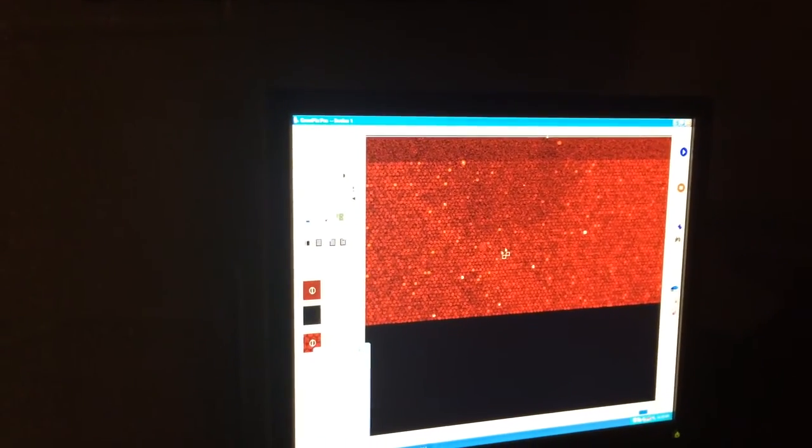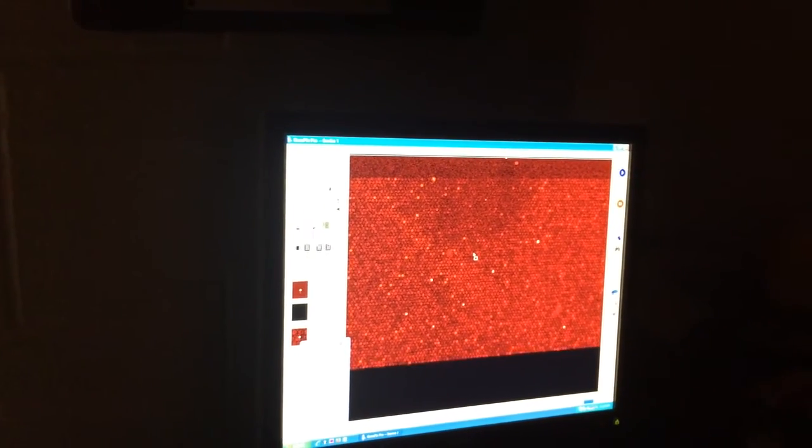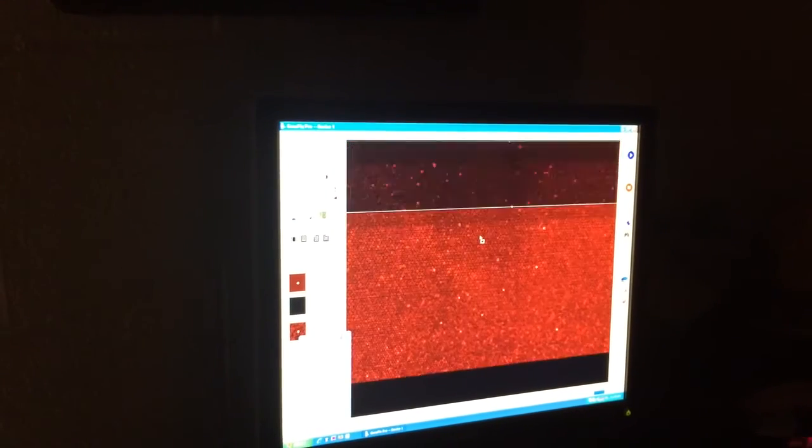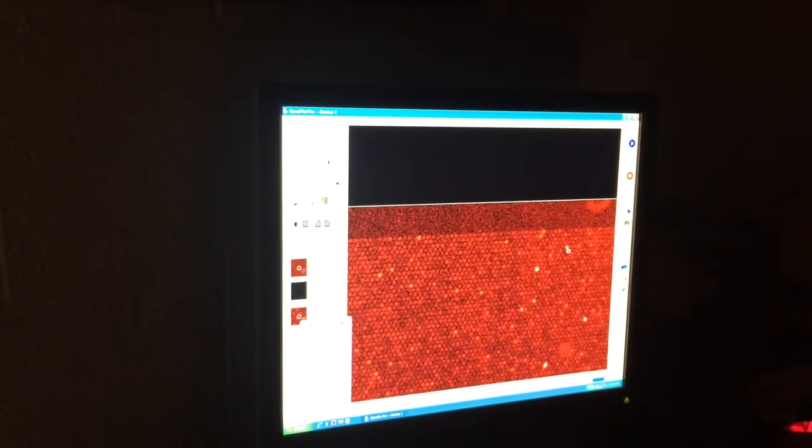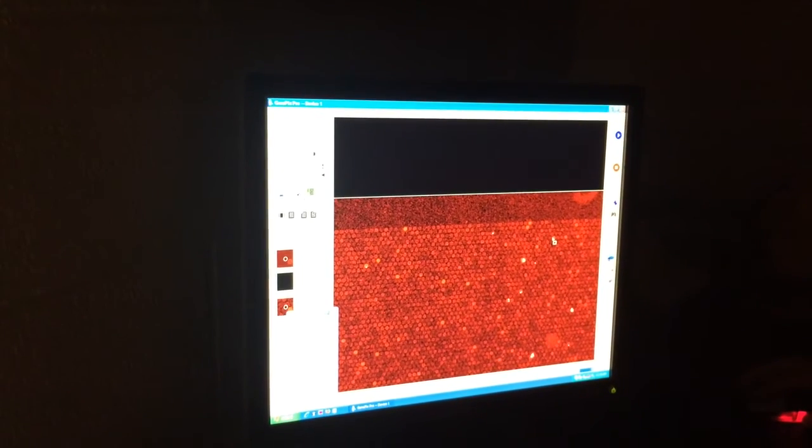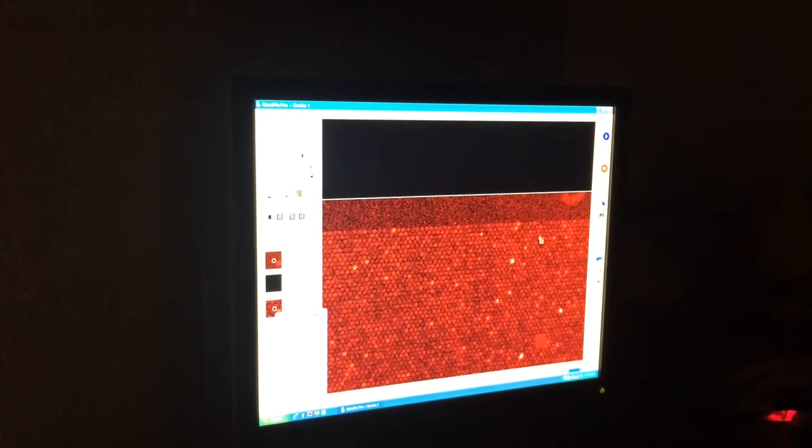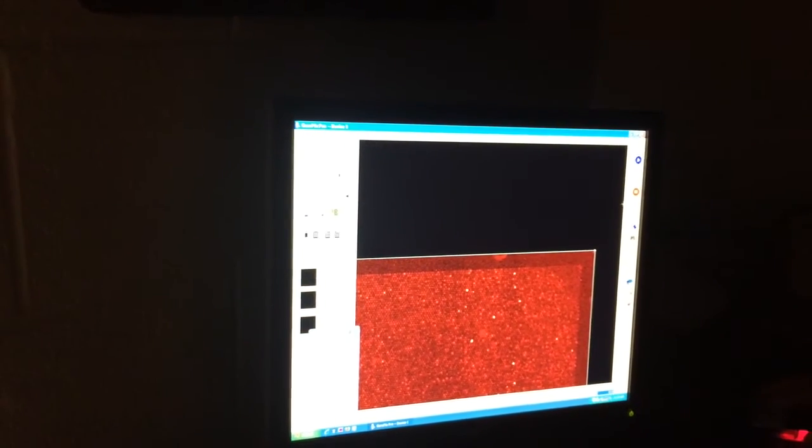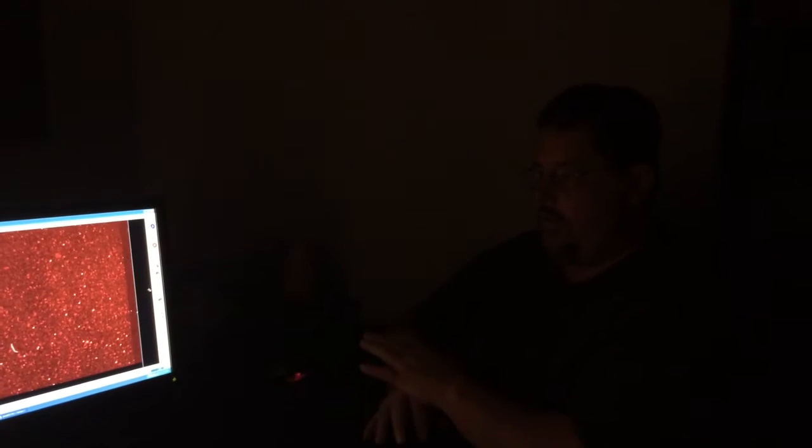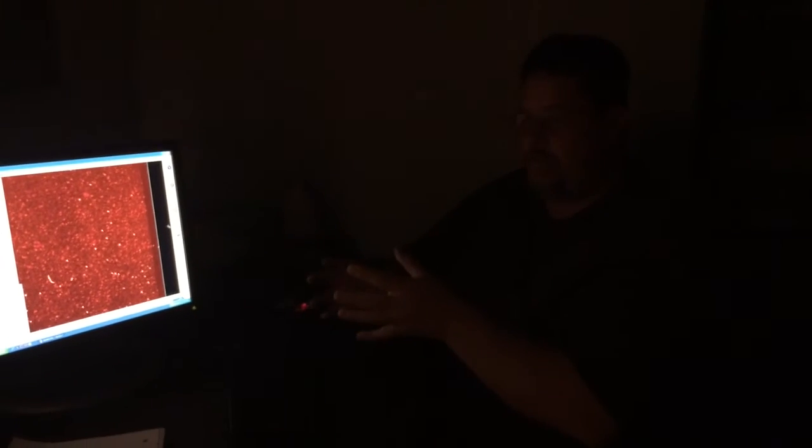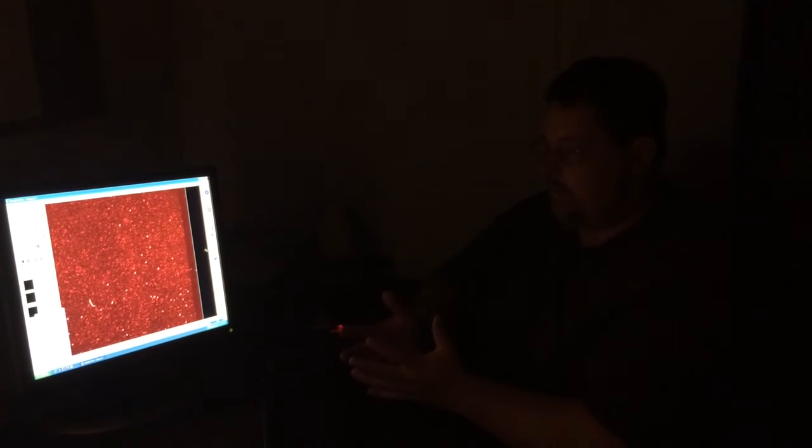Okay, so this is going to be our final scan. And then we'll save the image. And then I'll show you how to overlay the image with a map that tells us what genes are what for each of those individual spots. So here we go. Here's the red coming through again. And you can see how much more obvious the spots are at that fine micrometer resolution. So again, each one of these spots hypothetically represents a unique gene in the case of this particular caterpillar. And there's 44,000 more or less of those spots on here. So we're able to screen nearly the entire genome of this caterpillar in regards to these treatments. I mean, obviously we may be missing a few, but we're talking about thousands of genes. You're doing a pretty good job of screening them.